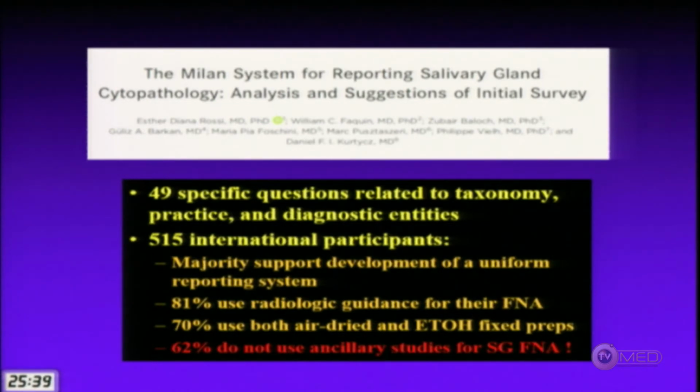70% of participants use both air-dried and alcohol-fixed preparations. I will say that for salivary gland cytology, for us to do the best job that we can, it's probably also best to have both alcohol-fixed and air-dried preparations. If you only have liquid-based preparations, I think your diagnostic abilities will be somewhat limited, although it can be done. But in my opinion, it's best to have both alcohol-fixed, air-dried preparations, and even a cell block for cases where you may need to do ancillary studies.